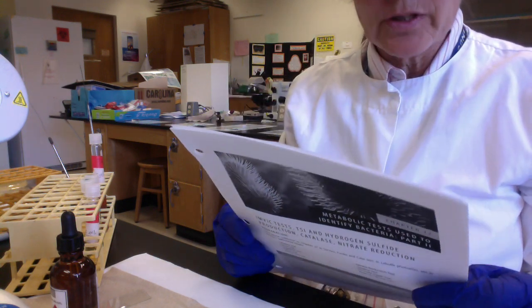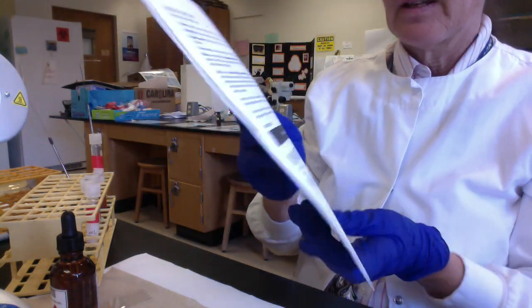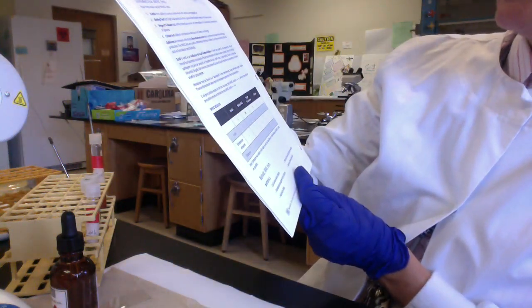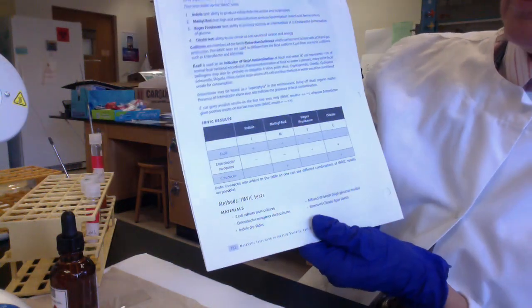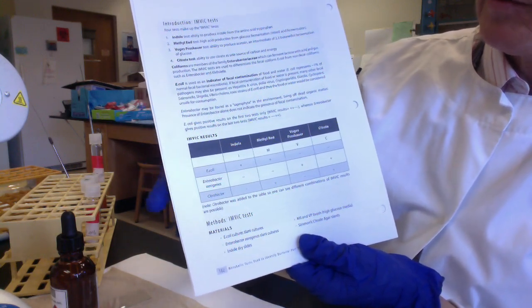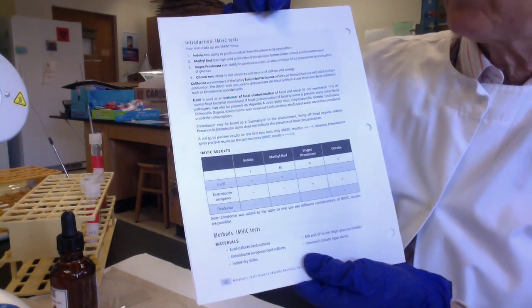Okay, folks, so the first test we're going to do are the IMViC tests. And the IMViC tests, folks, there's a table, and this is on page 182. There's a table comparing the results of different microbes when we run the IMViC test. The IMViC test, folks, it's actually a series of 4 tests.